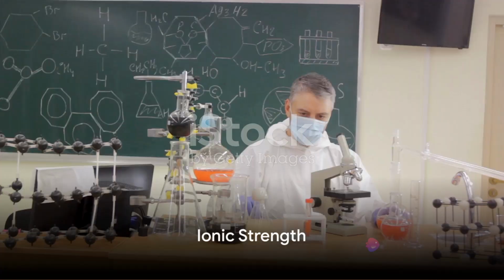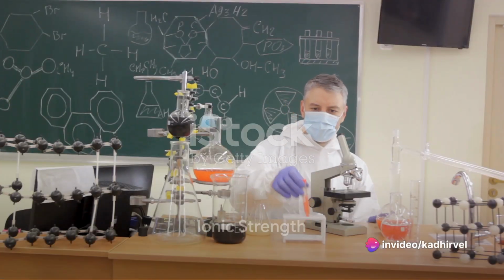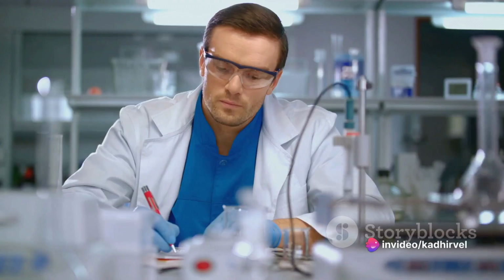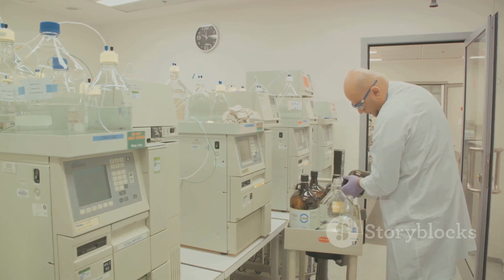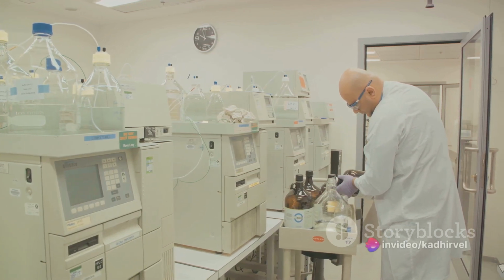Next up is ionic strength. This is a measure of the concentration of ions in the buffer solution. It's vital because it influences the strength of interaction between the antibody and the resin. This interaction affects the binding capacity, resolution, and selectivity of the chromatographic separation.